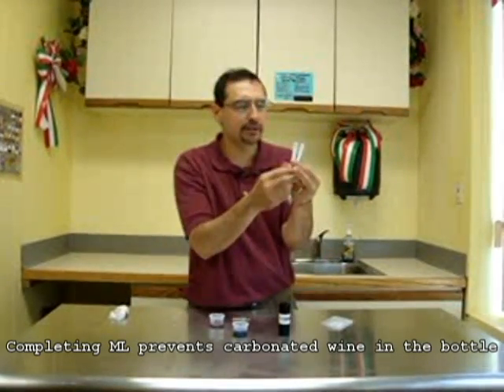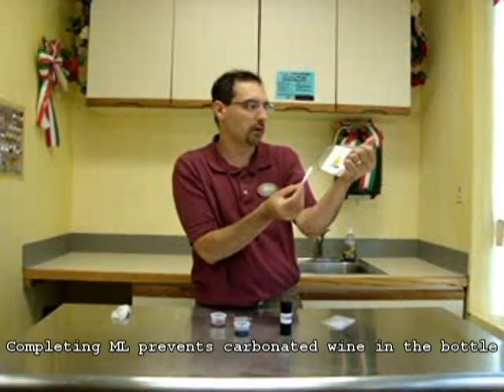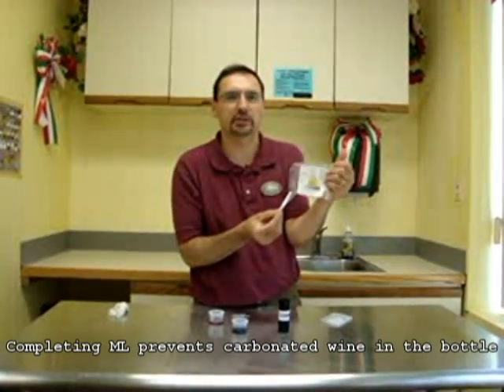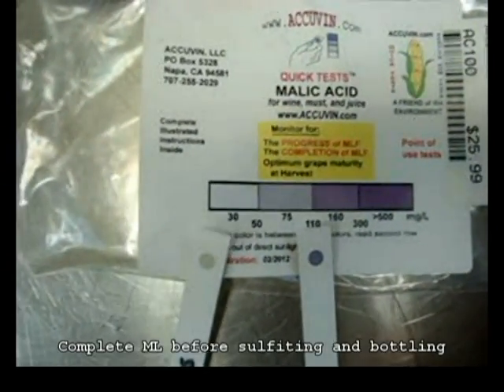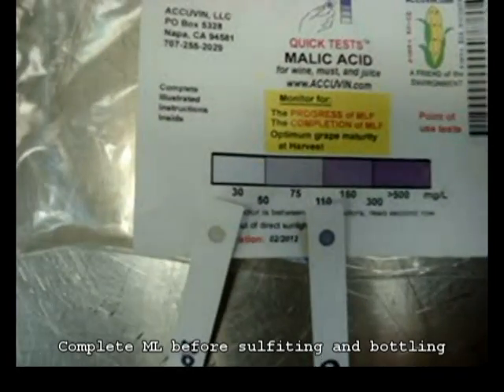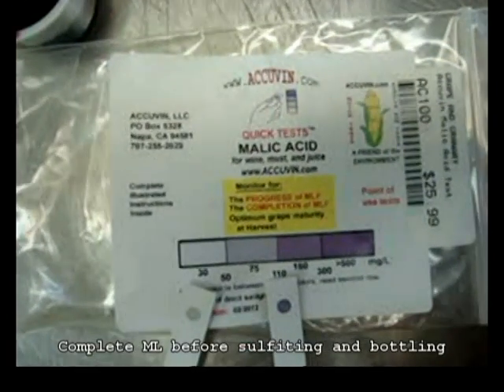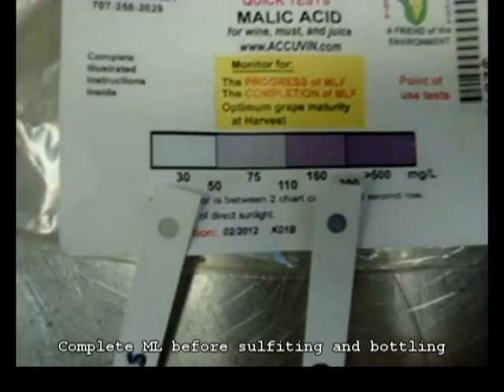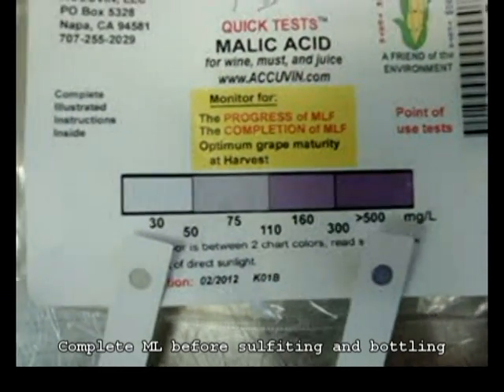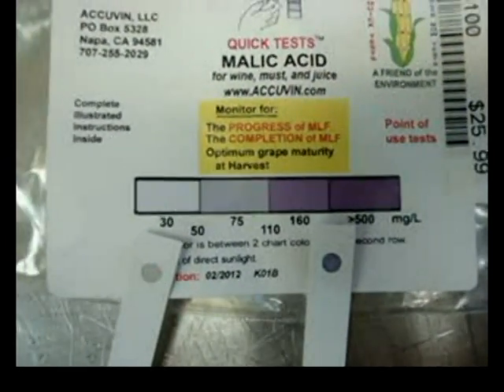We wait four minutes, and then we will compare the color of our sample to our chart, and that will tell us whether or not our wine has undergone a successful malic lactic fermentation. You can see here on our sample — the sample on the left that has undergone malic lactic fermentation for approximately eight months — it's much lighter in color and approximates 30 milligrams per liter. The sample that has only undergone malic lactic fermentation for approximately one month is much darker in purple and matches a color more in the range of around 300 milligrams per liter, or parts per million, of malic acid.